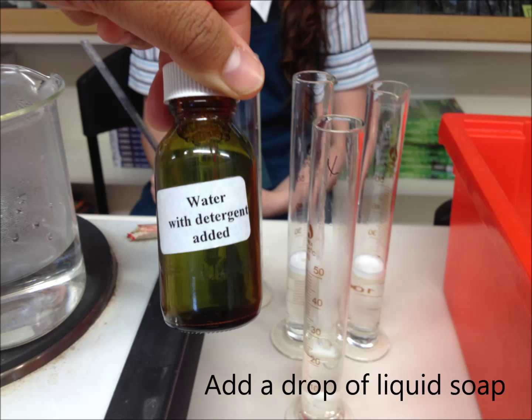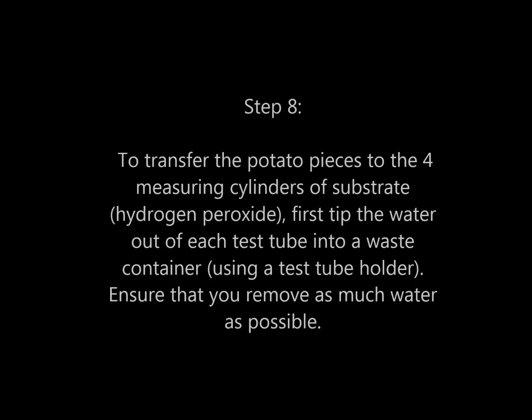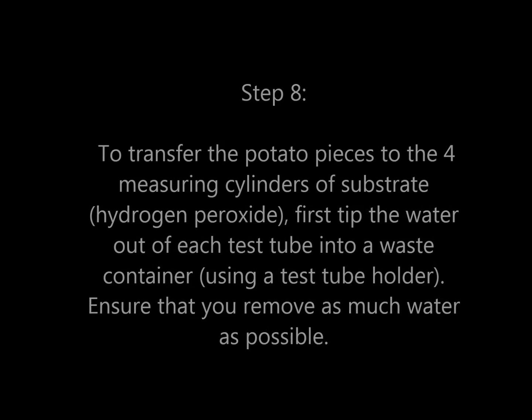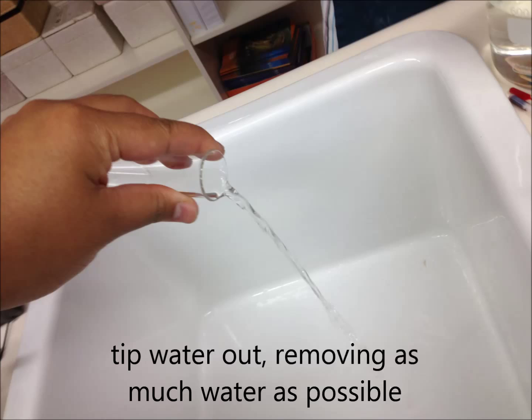Step 8. To transfer the potato pieces to the four measuring cylinders of substrate, first tip out the water of each test tube. Ensure you remove as much water as possible. Step 9.